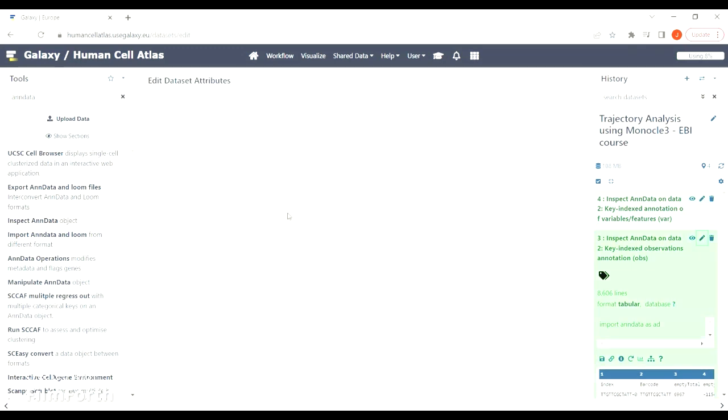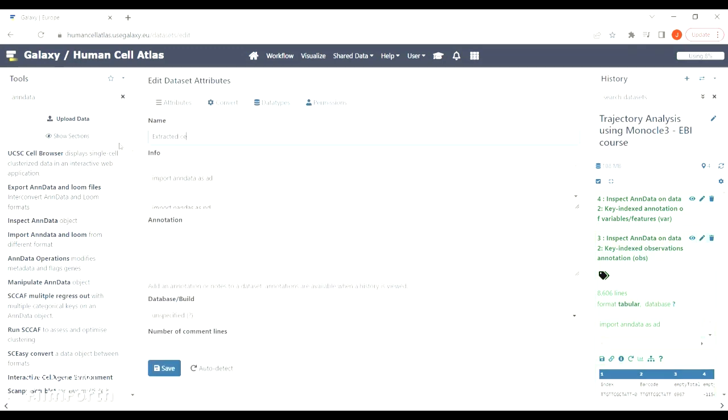Now quickly rename the file so that you know what is what.